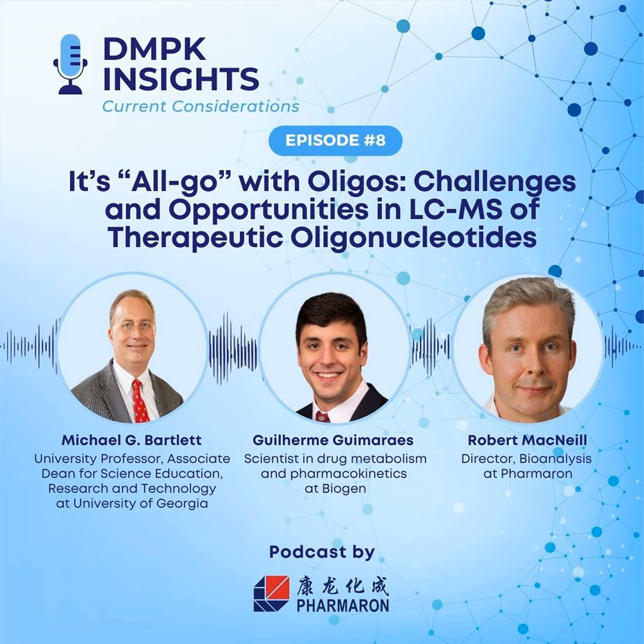Right. Sorry, Gui, I cut you off earlier. No problem. And I think just the use of ion pairs in general just paired well with what the field started to require in terms of the emergence of these oligos as therapeutics. And now you need chromatographic selectivity, and you also need higher sensitivity to be able to detect some of these either low impurities or whatever metabolites you may be having. So if you could get both the chromatographic selectivity as well as sensitivity on the mass spec, it just paired very well with what was needed from these methods. And so I think the popularity just increased even more.